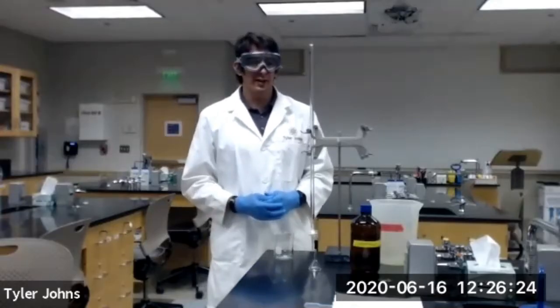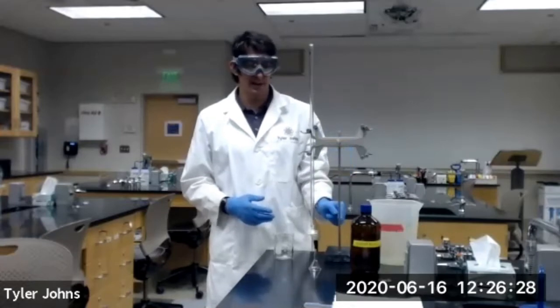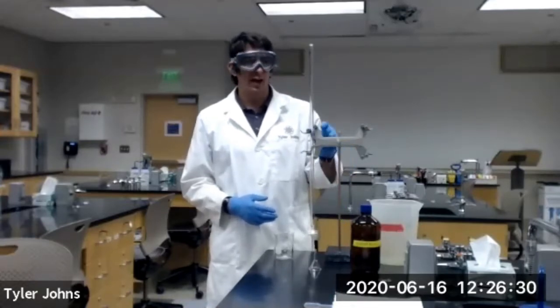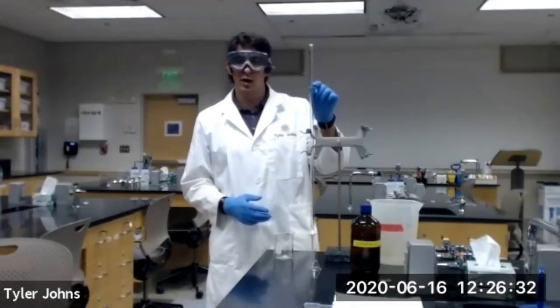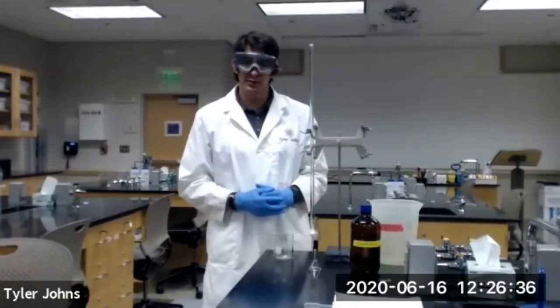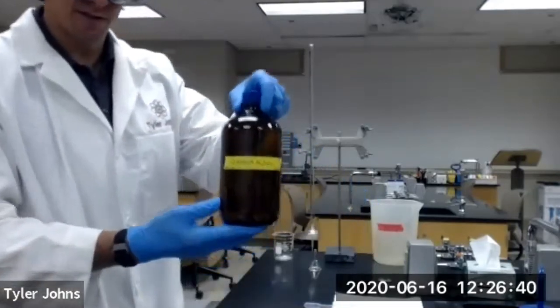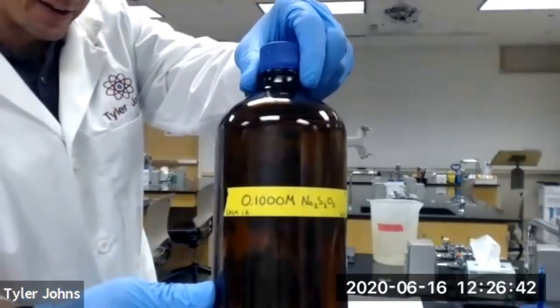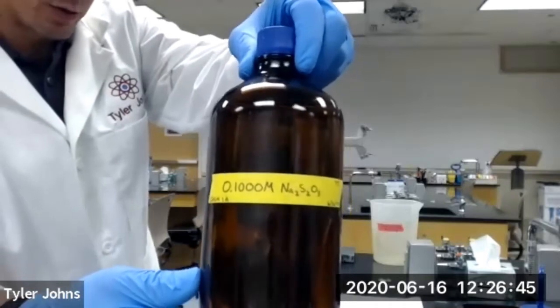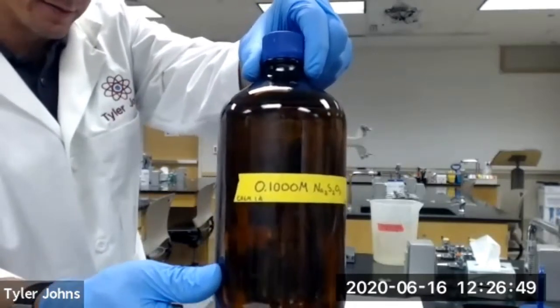Okay, so I've gone ahead and set up a burette which is secured to our equipment stand using a burette clamp. I've already previously washed our burette with deionized water. What we're going to do now is take 5 milliliters of our standard solution, which is 0.100 molar sodium thiosulfate.